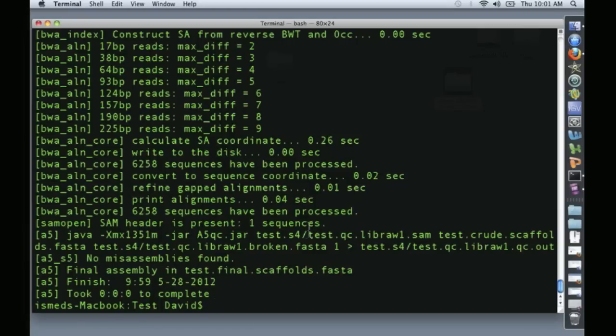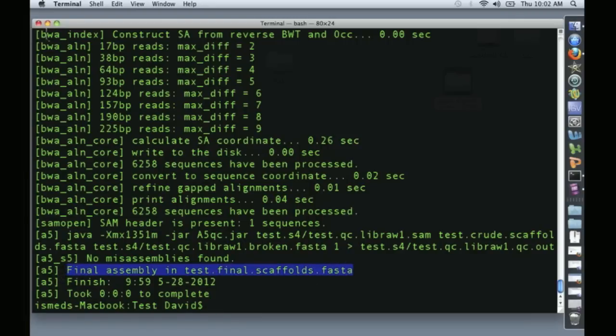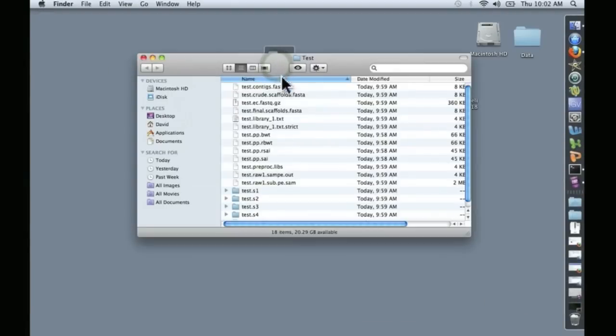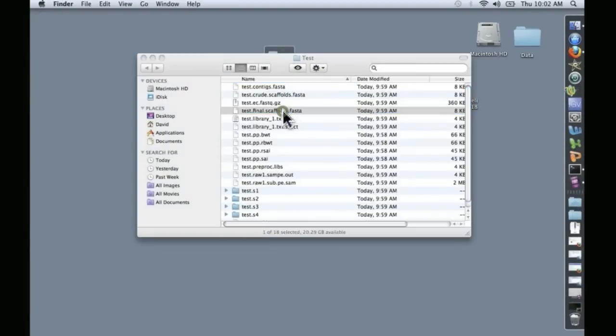Alright, on my old junky Mac that took about two minutes. It says right here that the final assembly is found in this file, Test Final Scaffolds FASTA. Let's take a look in our test folder, there it is.